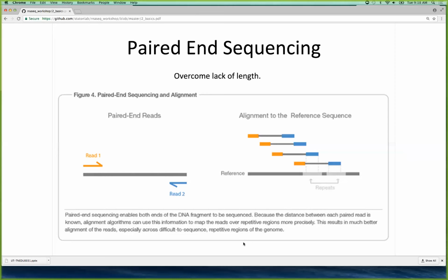What's the major limitation on extending reads? I've always heard that we can't. Yeah, I think it's the fidelity of the polymerases as they build the molecule longer and longer, they fall off, they get corrupt. And you'll see with your reads, they get worse and worse in quality toward the end. And I think it's because you have a glass slide, and as you're building this and imaging the base additions, the fluorescence of the base additions from underneath, it just gets too long and you can't image it very well and it gets fuzzy.